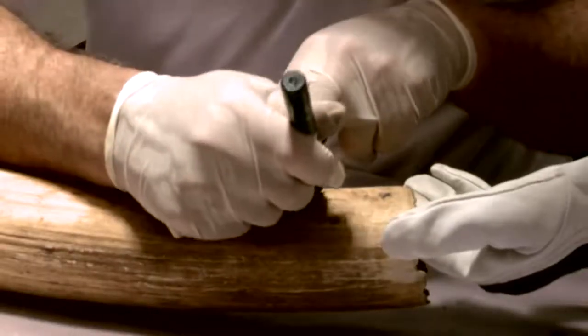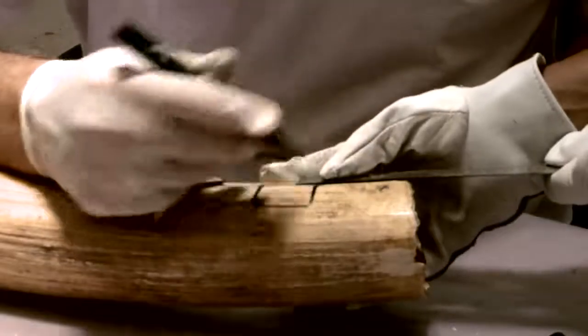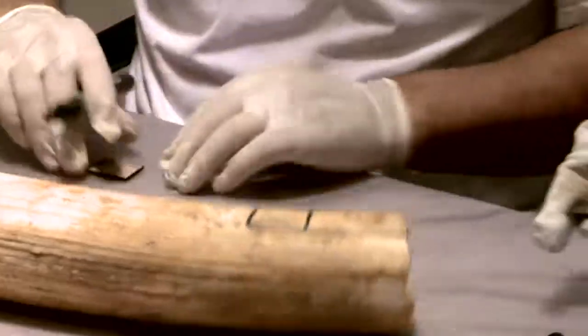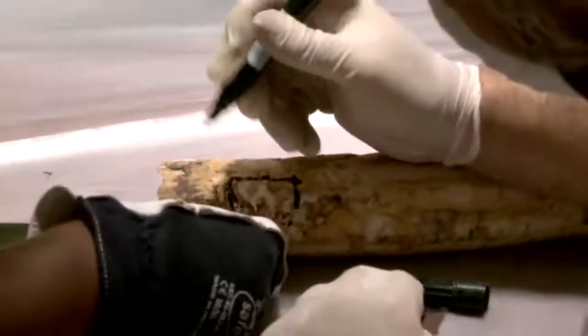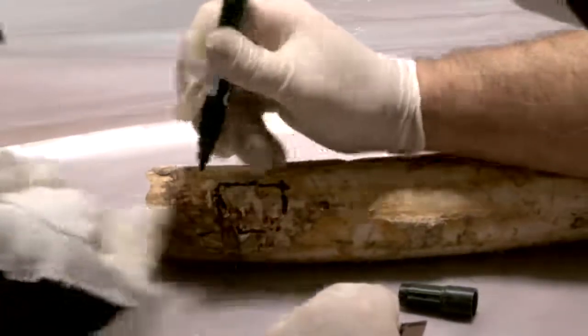Place the cardboard template on the area of the tusk where you will make your cut and draw around it. If tissue is visible, try to include it in the piece being cut, unless doing so makes the piece too thick. If you require more than one sample, use the template to draw additional areas to cut as needed.